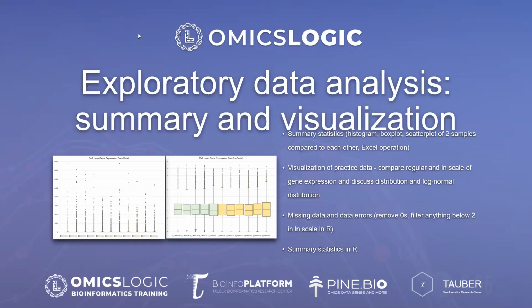And Lydia mentioned a gene can have a lot of reads or not. Usually it's in between genes. So yes, sometimes you might have a lot of reads in one sample, but another one you might not have a lot. But is that a technical issue, or is there some actual biological significance behind that? So normalization is key when you have raw data, and you've already gone through log scale and quantile normalization, both very important within biology. And then, missing data, sometimes it's not good to have zeros.